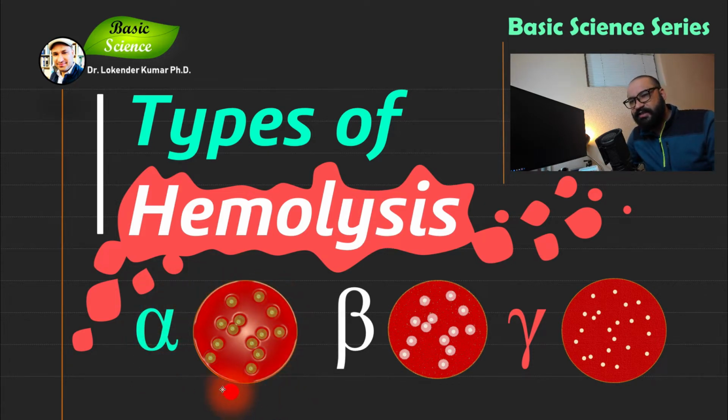In this, you can see I have tried to design a blood agar plate where I have bacterial colonies that are present on the surface of the blood agar plate, and they are showing greenish zone of hemolysis. That particular greenish zone of hemolysis is mainly a characteristic feature of alpha hemolysis.